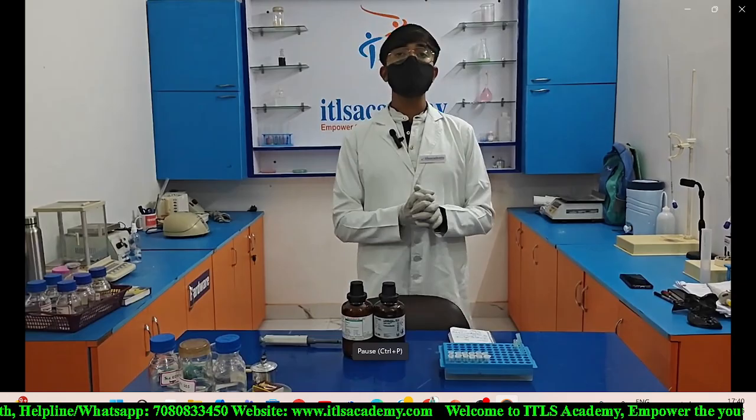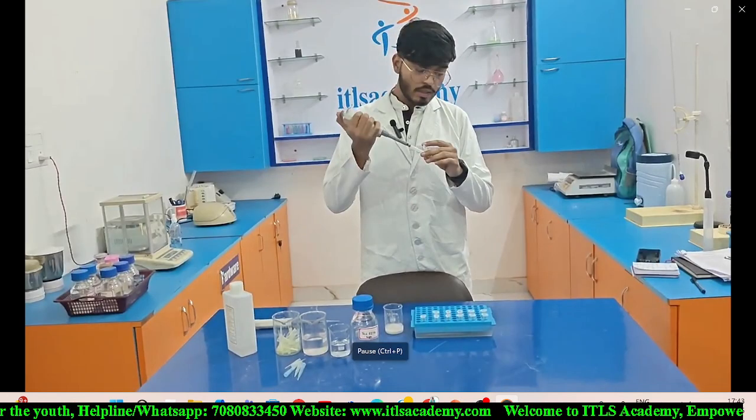And after adding 200 microliter of chilled ethanol in each of the eppendorfs, we need to keep these eppendorfs for a few minutes, and after that we need to discard the supernatant. So after adding chilled ethanol, now I'm going to discard the supernatant, and after discarding the supernatant, I'm going to add 50 microliter of TE buffer in each of the eppendorfs.